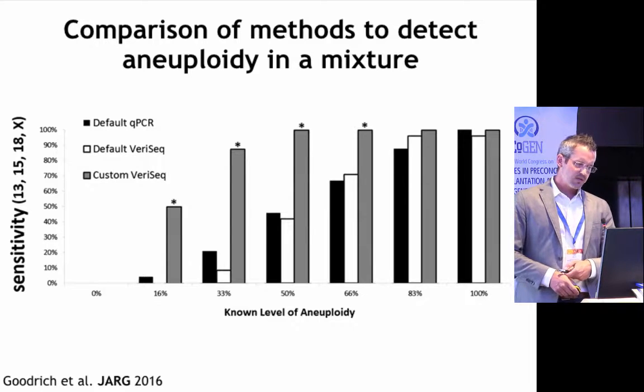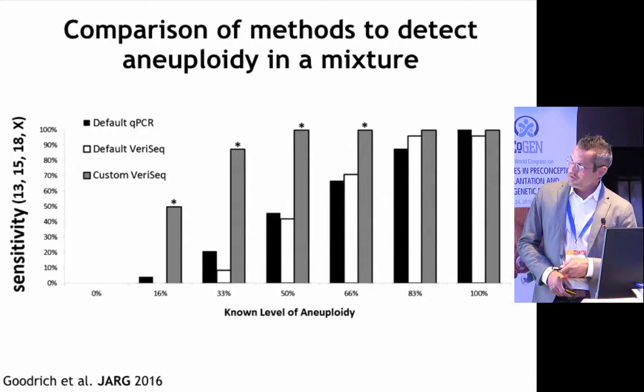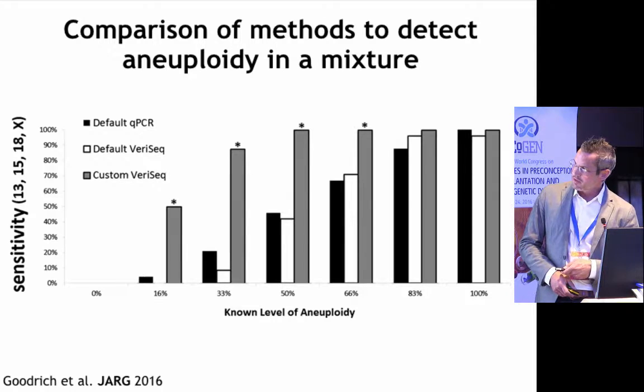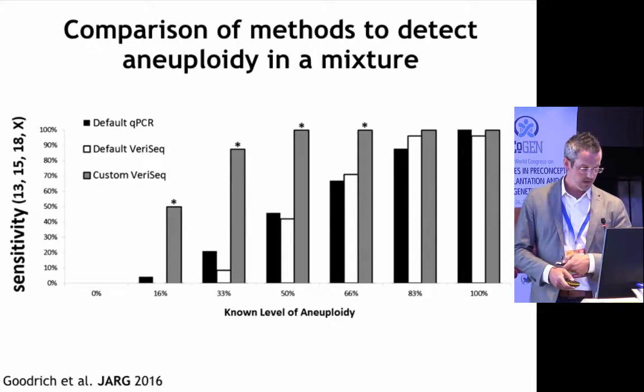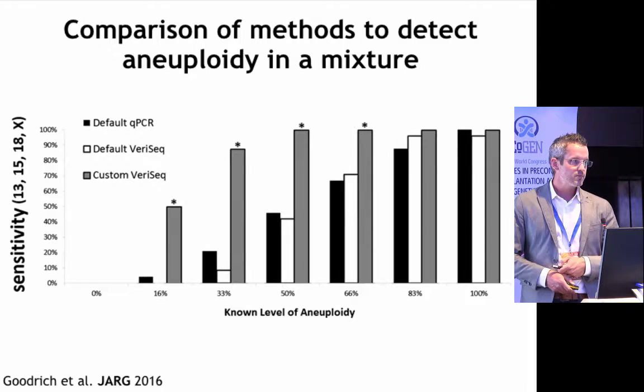And also recently there was a set of criteria published by another group where they interpreted the data differently by resetting thresholds to call something mosaic or not. And you see, in fact, this increases the sensitivity so that you do predict aneuploidy in a significantly higher percentage of the cells at these lower levels of mosaicism or aneuploidy. But unfortunately, when you do that, you also have to evaluate the specificity. So how often do you call something aneuploid when it's really not?